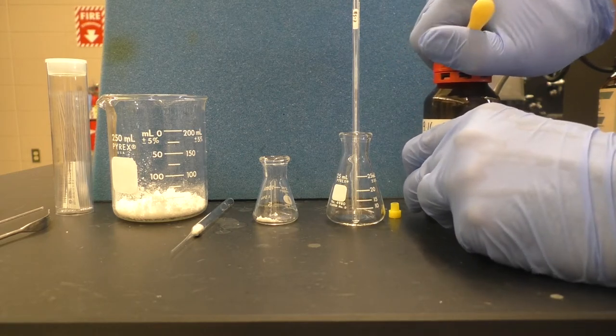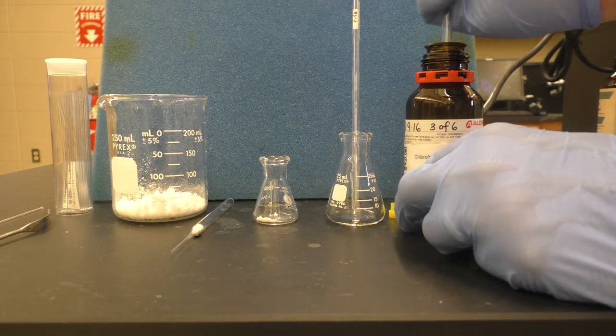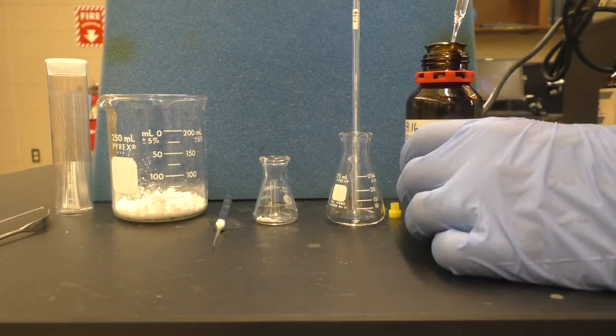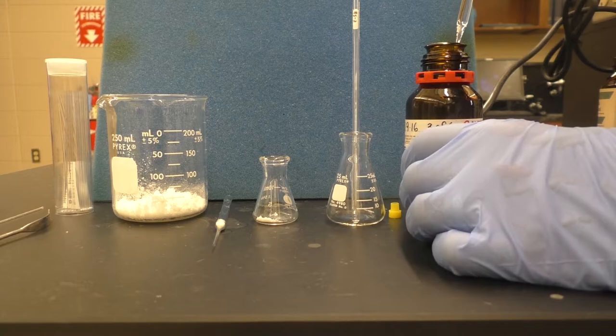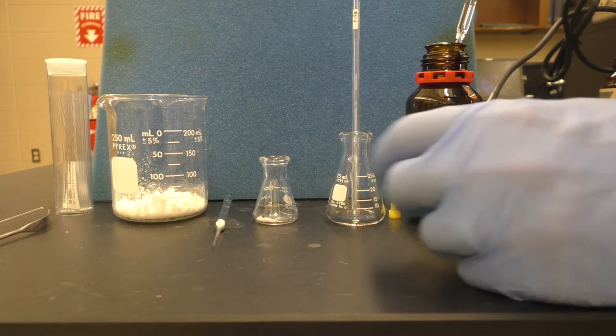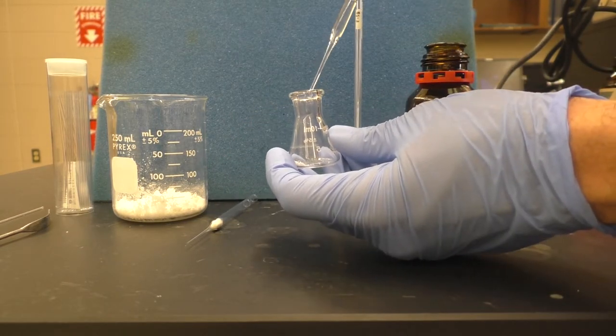I've included a Pasteur pipette here with some cotton filtering in case I'm not able to dissolve all of the material, and then I can use that filter pipette to remove the solid material before transferring into the NMR tube.